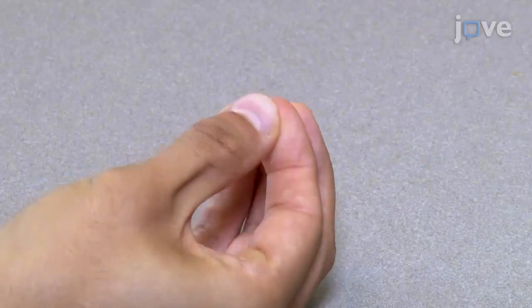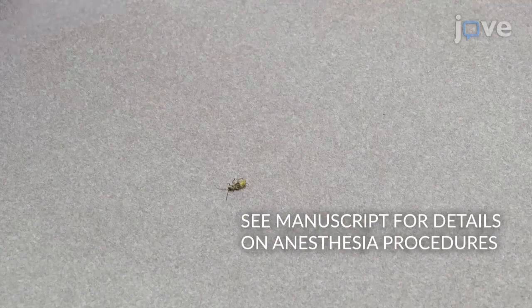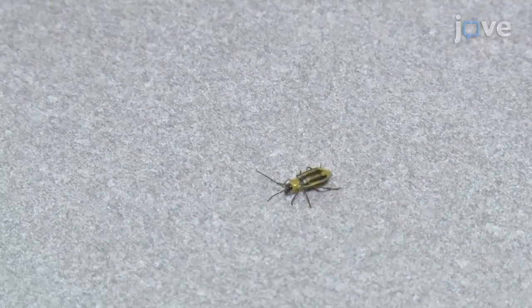Place an adult beetle on a flat surface and position its dorsal side up. Reposition the legs if necessary so that the beetle lies completely flat on the surface. Use a butane lighter to briefly heat the dental wax on the wire for less than one second. Do not reuse the wax.